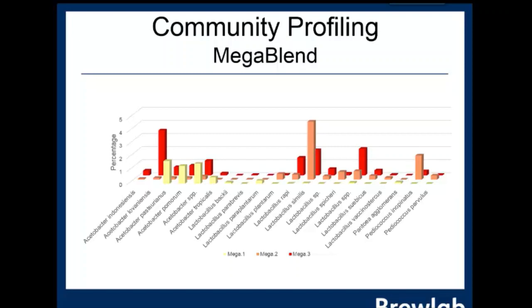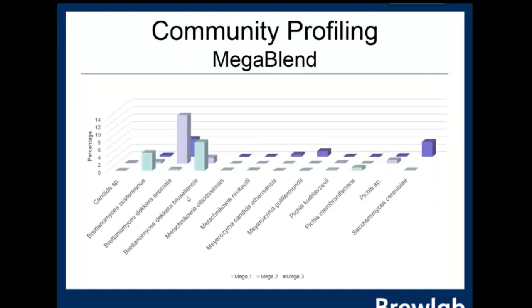sequences in these samples. And what we find in the Mega 1, 2, 3 of the progressive fermentation is that we've got initially a predominance of acetobacters, fewer lactics initially, but the lactic acid bacteria develop as the growth pursues, and there's a bit of a balance at the end. So we've got quite a range of acetics, a good range of lactics and pediococcuses, with one maybe more unusual, Pantoea. But what we didn't find were any food pathogens, which is obviously a positive result.